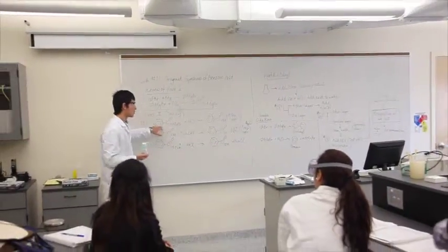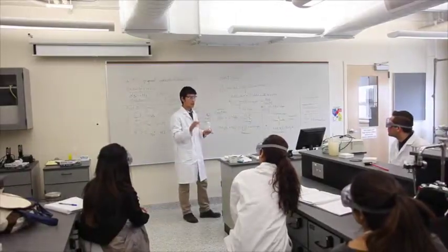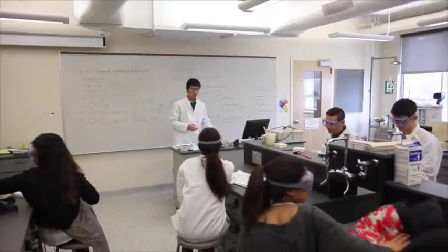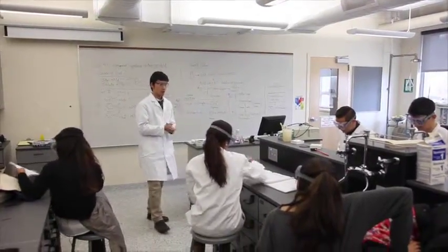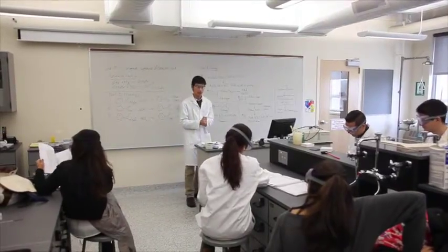So the first step, we're going to add hydrochloric acid. How much hydrochloric acid can you add into the flask? 7.5 milliliters of the hydrochloric acid together with some ice. You can just add a random amount of ice into the beaker and also add the hydrochloric acid inside.